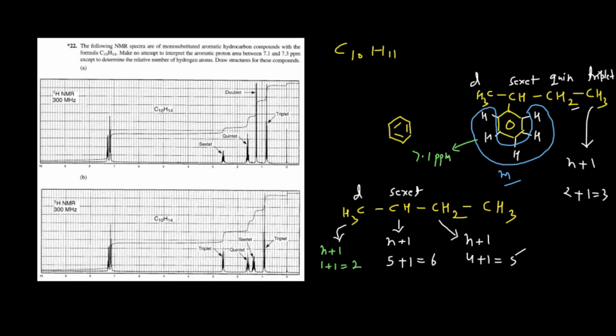And you can see here this hydrogen, which is only one hydrogen, is connected with the benzene ring, and the circulating electron cloud of the benzene ring will cause magnetic anisotropy, and due to the magnetic anisotropy, this sextet will be very downfield, resonating at somewhere around 2.6 ppm. So that sextet will be there at 2.6 ppm, right?